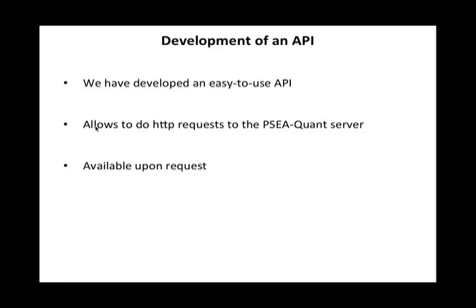So some of the new developments of PSEA-Quant, I have a brief list here, and I'll go into the details individually for all of them. To list them, we developed an API in order to link PSEA-Quant with some of the other tools of the center. We've also added new organisms for the enrichment analysis.